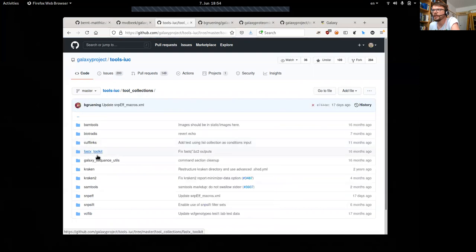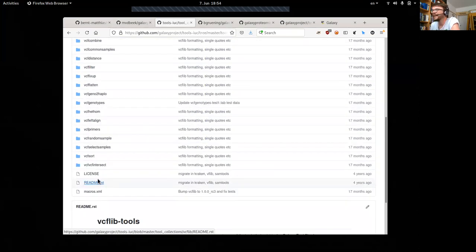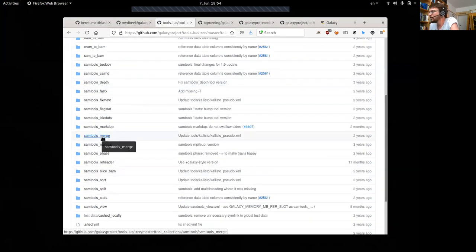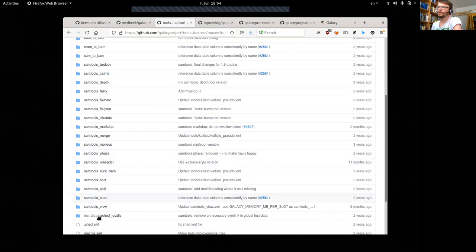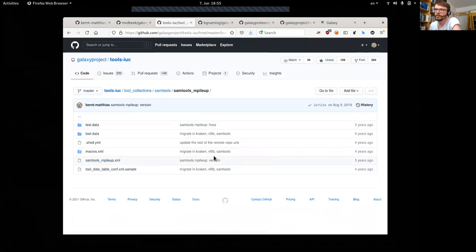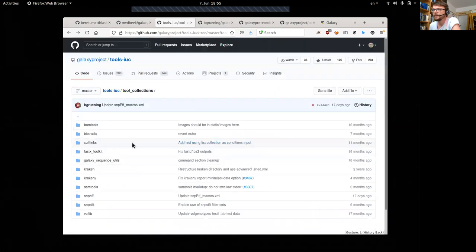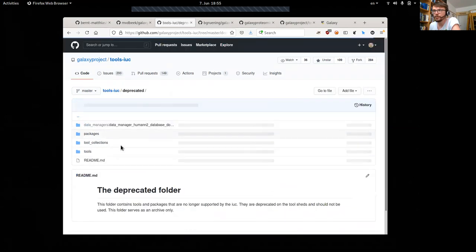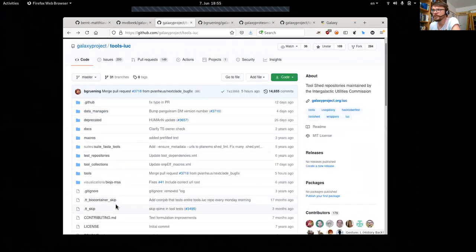There is also a tool collections directory which contains connected tools. For instance, if you take the SAM tools repository, they all wrap the SAM tools command which has many subcommands, and each subcommand is represented by one tool. They live here, with a test data directory, tool XML, and so on. There is no clear distinction between tools and tool collections — also in tools there are often larger collections. Then there is a deprecated directory which contains deprecated tools, packages, tool collections, and also data managers.